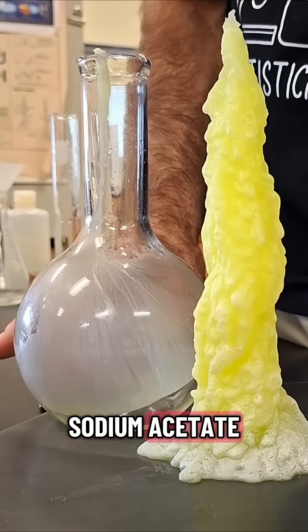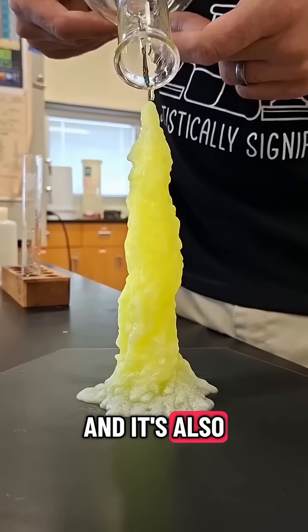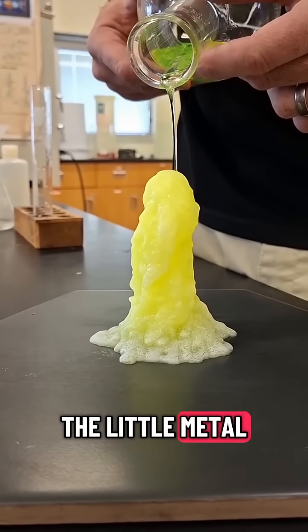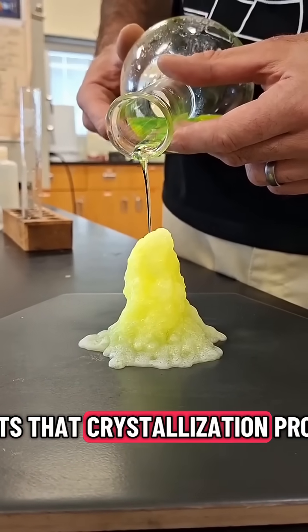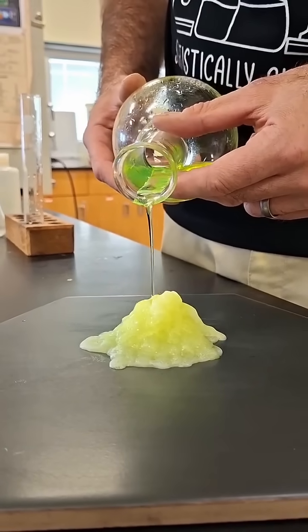Fun facts about sodium acetate: it is the flavoring in salt and vinegar chips, and it's also used in those reusable hot packs where you click the little metal thing back and forth, and it instantly starts that crystallization process, which is, of course, quite exothermic.